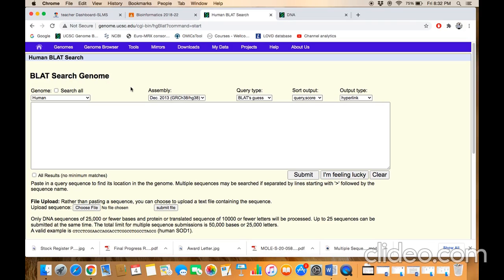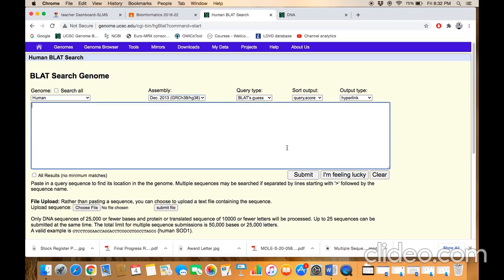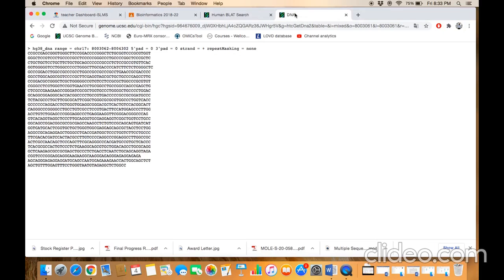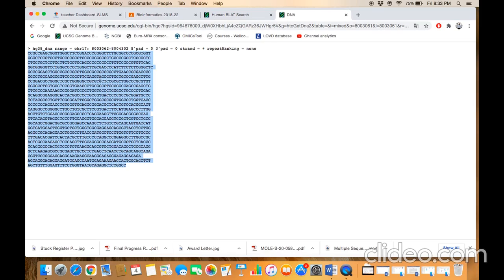For this sequence, for example, we presume that we don't know which gene this sequence belongs to and on which chromosome this particular gene is present. So for that purpose, we will do the local sequence alignment.